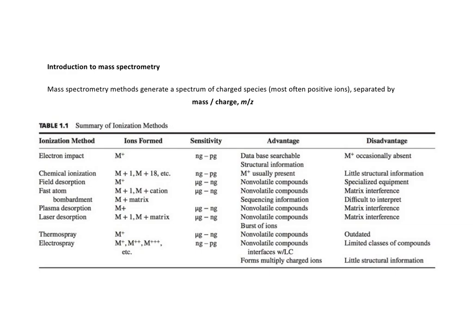Mass spectrometry is a technique that has a century of history and has been noted by several Nobel Prizes to initial discoverers and subsequent innovators. Always recall that mass spectrometry methods will only detect charged ions. What is specifically observed is a ratio of mass over charge, m over z.